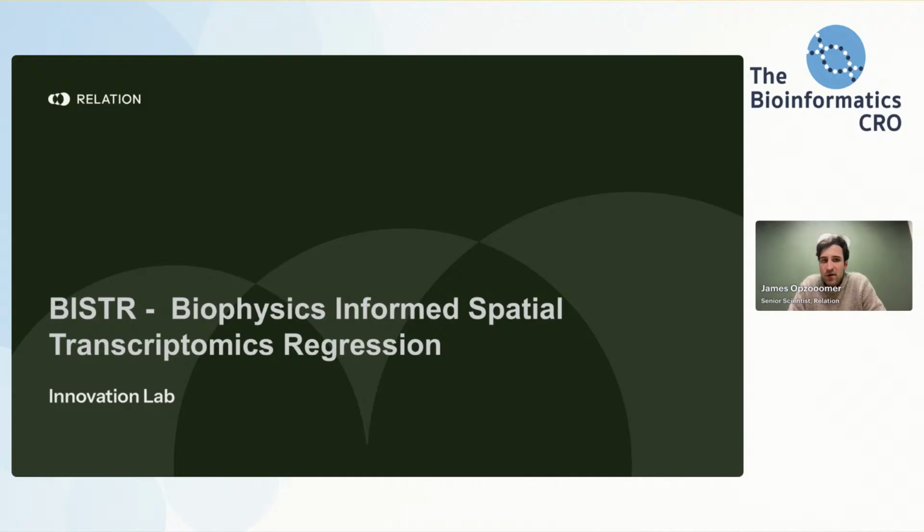So together, these genomics and single-cell datasets give us a dense, patient-centric view of disease biology. And in particular, we in the Innovation Lab are interested in how we can utilize this spatial transcriptomics data to disentangle the causal microenvironmental signals, so the cell communication pathways that drive cell state and cellular response to microenvironment. And this has led us to develop a new analysis method called BISTR, or Biophysics-Informed Spatial Transcriptomics Regression, that I'd like to share with you today.